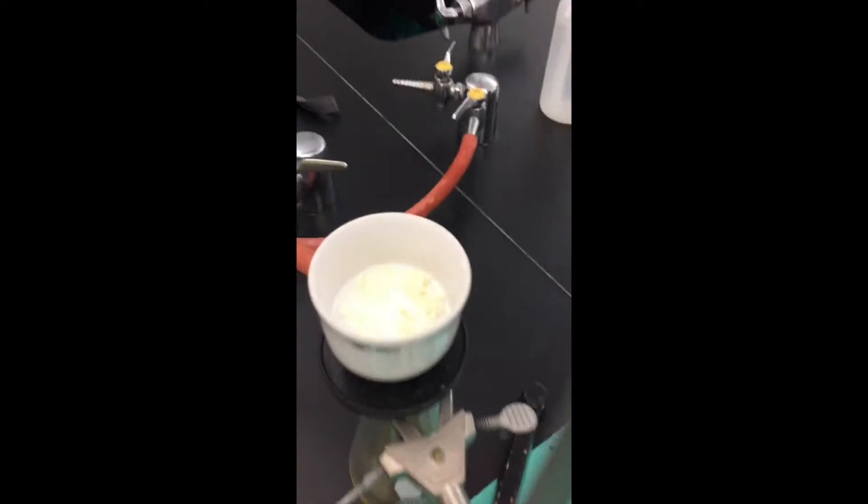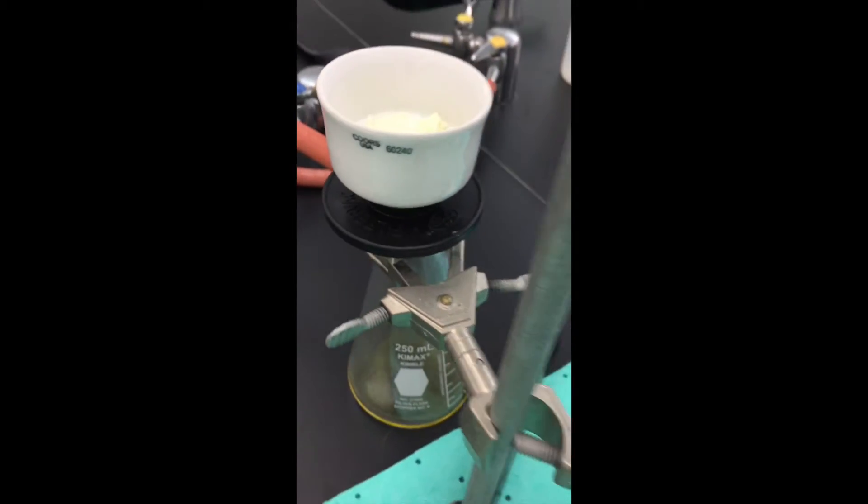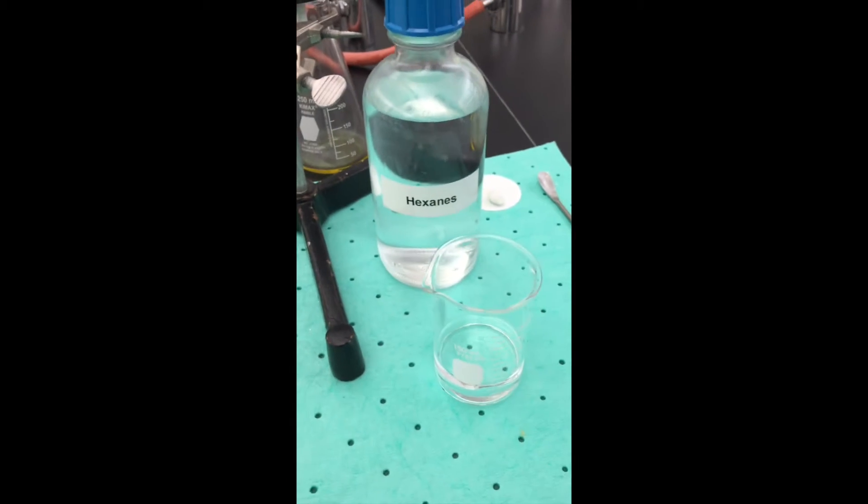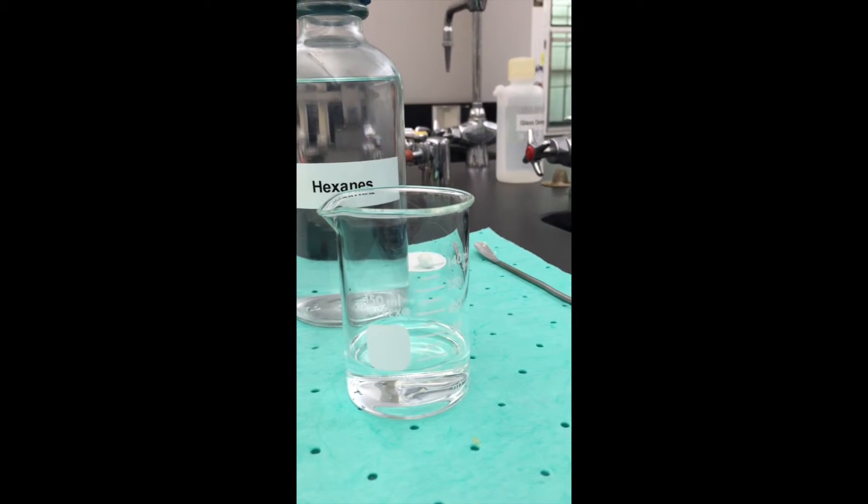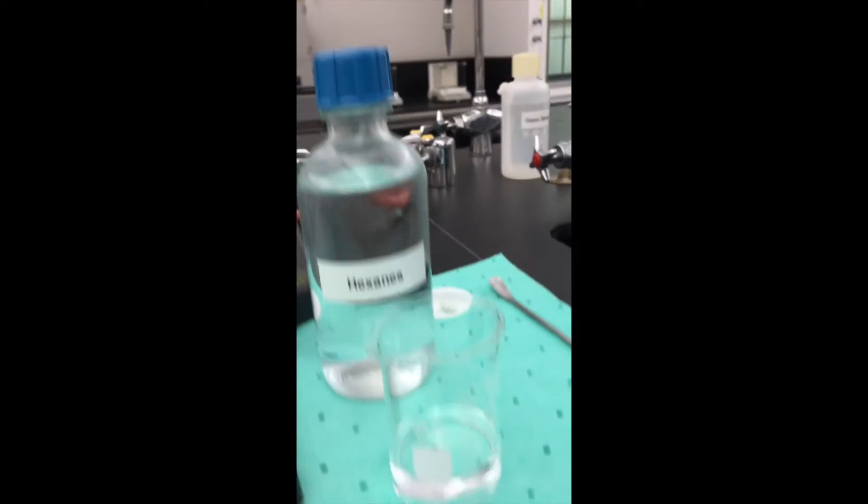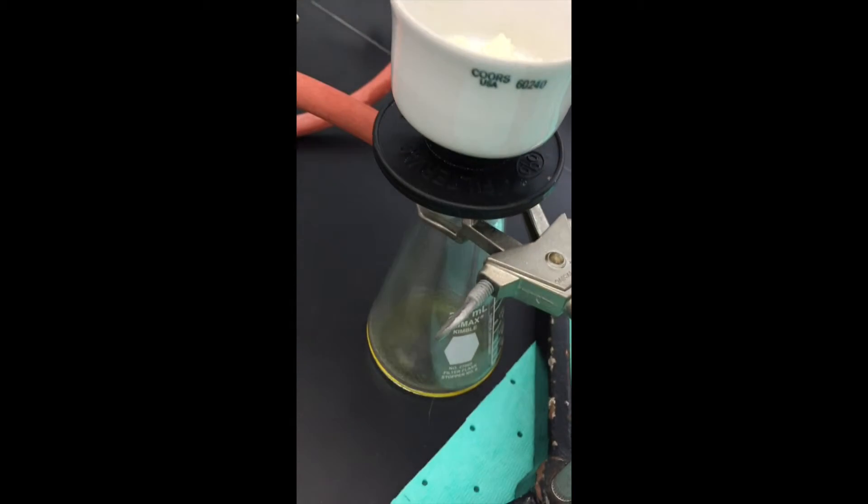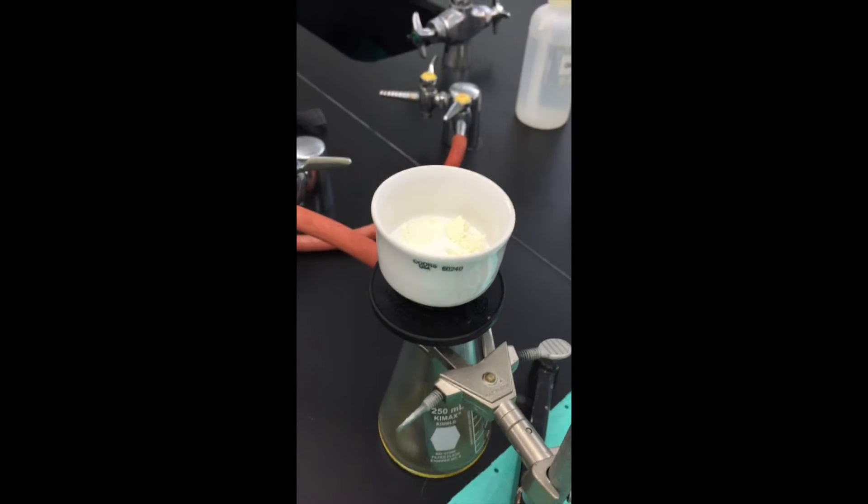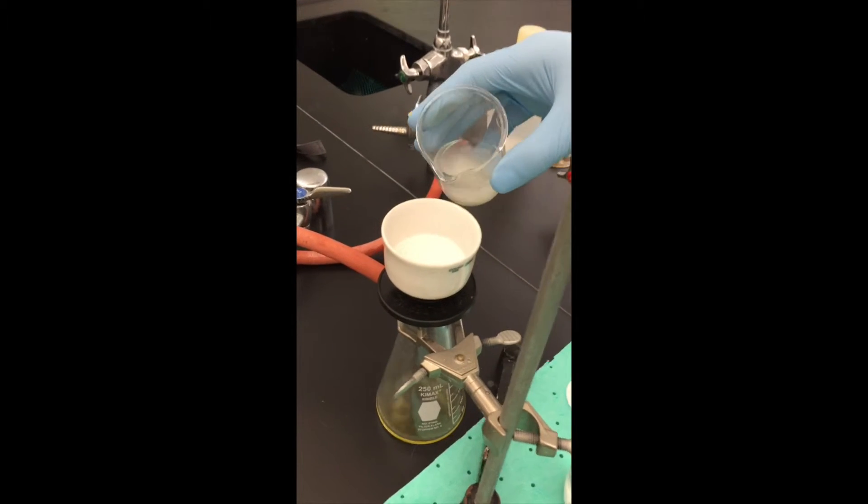Okay, so now we are going to take the solid that precipitated out for vacuum filtration, and we are going to suspend that in about 15 milliliters of hexanes liquid. And after we do that, we're going to re-filter it again with new filter paper back through vacuum filtration. And now the suspended product from the hexane is going to be filtered through.